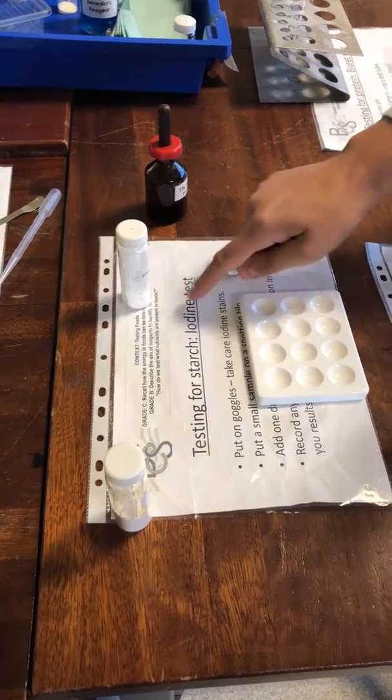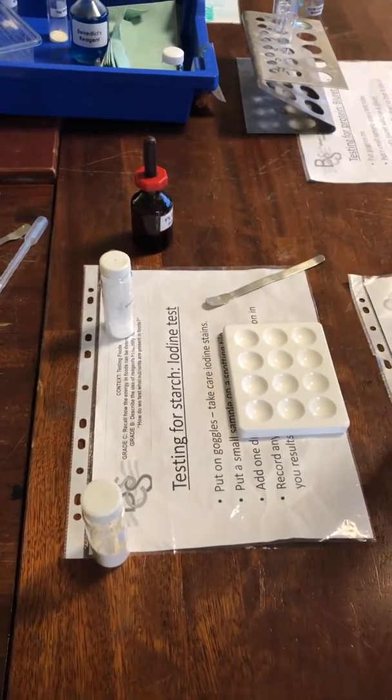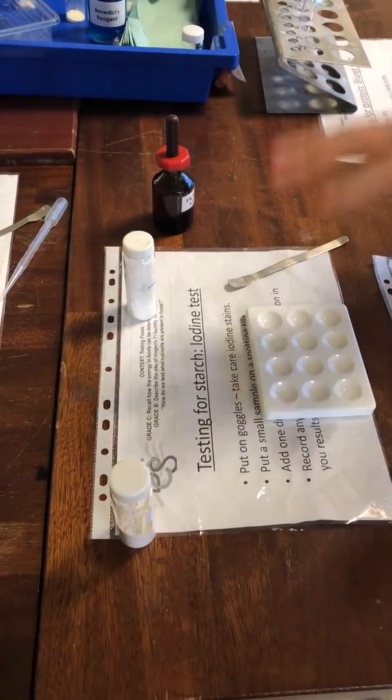So now we're going to be testing for starch using iodine, so it's known as the iodine test. We want to make sure we've got goggles.